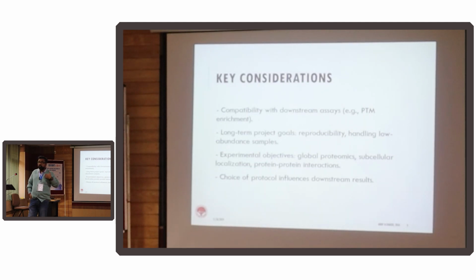How does your body proteome change? So they are doing a multi-omics analysis: proteome, metabolome, metagenome. It will be a multi-center study. Multiple labs will be involved. So my long-term project goal is reproducibility across labs. You cannot use instruments or protocols that are very sensitive to environmental conditions. And these are real-world experiences that we have. Few experiments can be done very easily at Allahabad. Few experiments can be done very easily at Kolkata or Mumbai, just because the weather is as such, right?